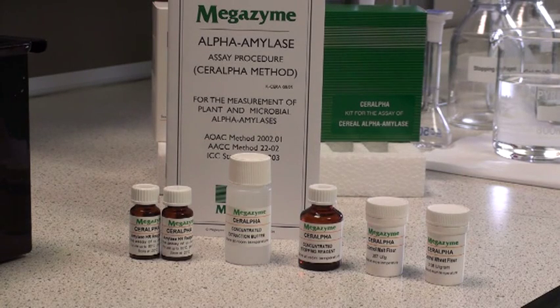As received, the Ceralpha kit contains a booklet with the full assay method details, two vials of substrate which is blocked p-nitrophenyl maltoheptaoside plus thermostable alpha-glucosidase, concentrated extraction buffer, concentrated stopping reagent, and a control malt flour. A control wheat flour is available on request.